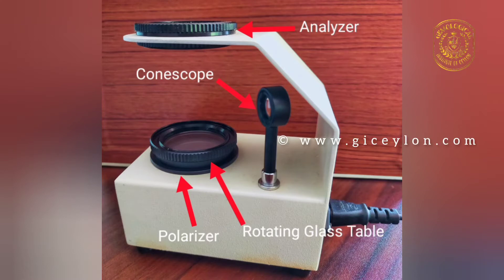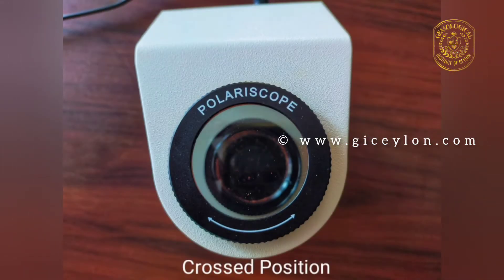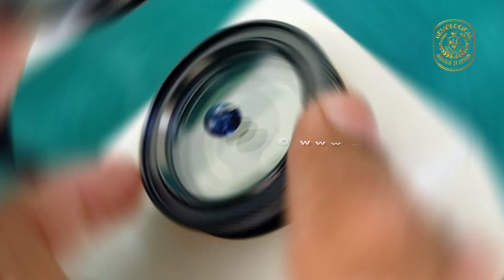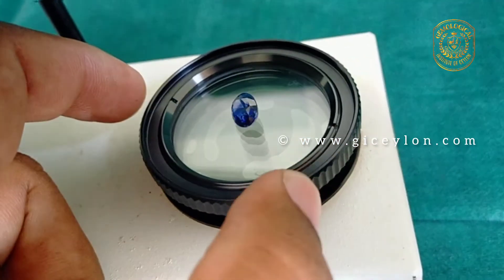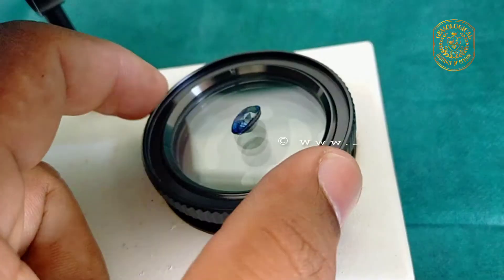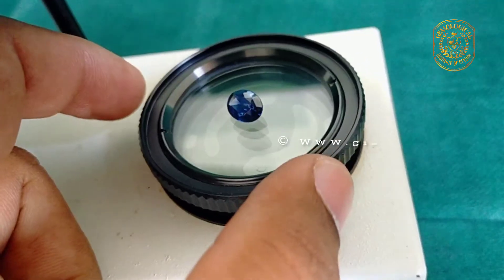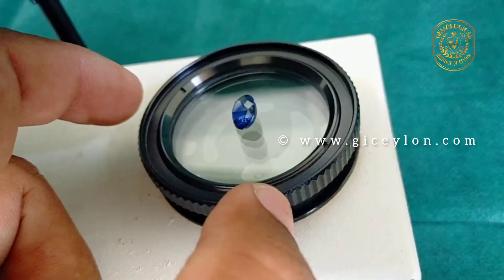Limitations in use: before testing materials in the polariscope, always make sure that the two polarizing filters are set in the crossed position. Make sure the gem is clean and has sufficient transparency, at least in part, to allow some light to pass through it. The polariscope is best used in an area shielded from surrounding light. Rotate the material in all directions — a faceted stone resting on its table facet must be rotated on that facet and also rotated in various other orientations to avoid missing optical information.